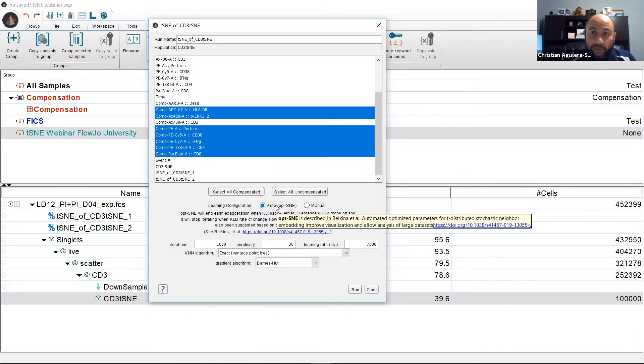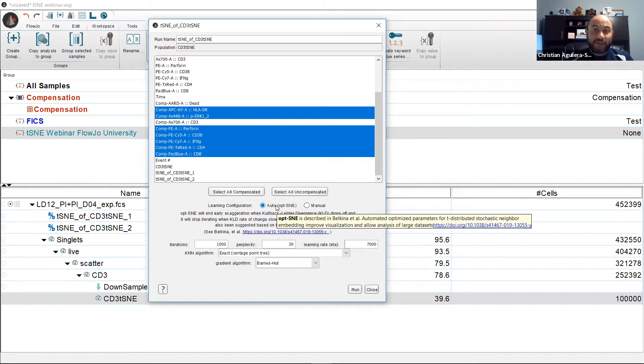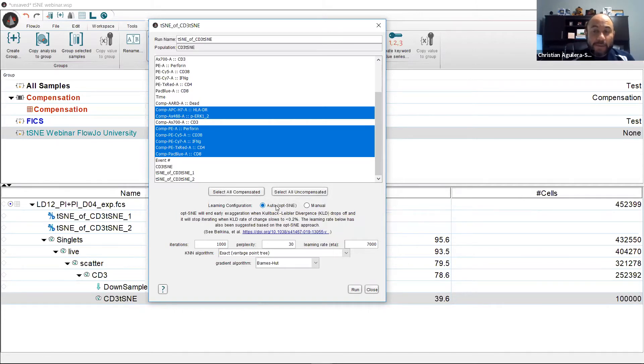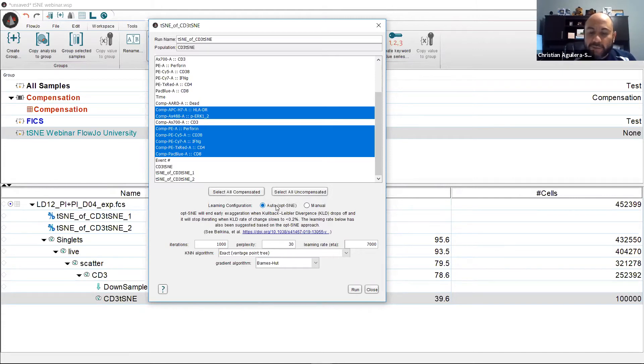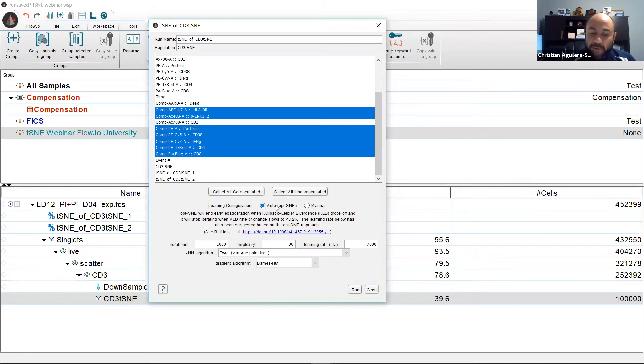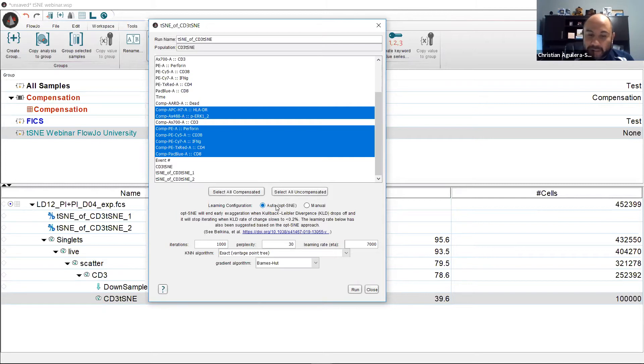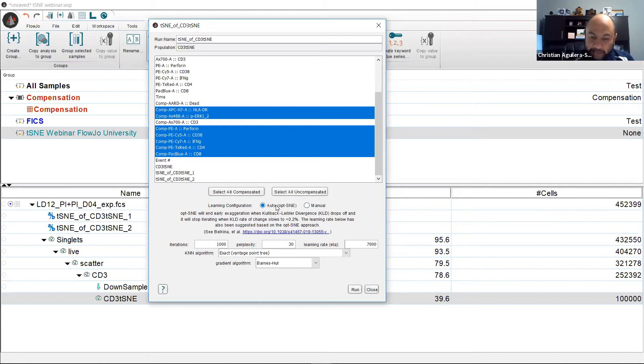At CYTO 2019, FlowJo presented a t-SNE of 40 million events. That way you have an idea that we don't really have that limitation. Lastly, the t-SNE result you get has been optimized largely based on the Kullback-Leibler divergence. So you don't have to run several t-SNE plots at different iterations, learning rates, and or perplexities.